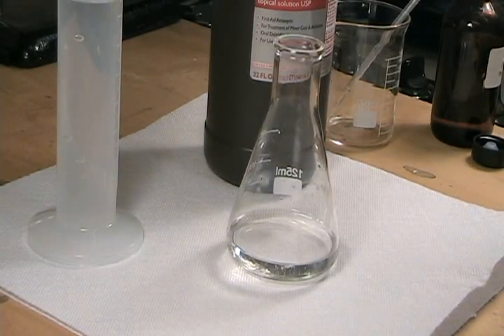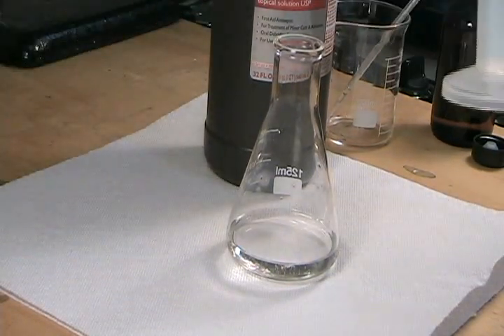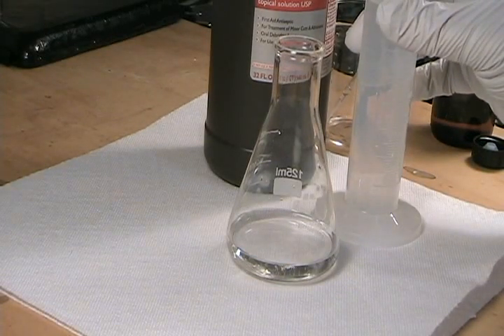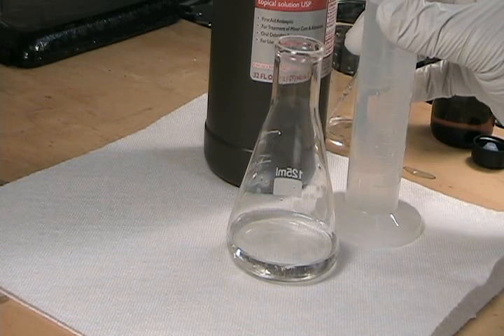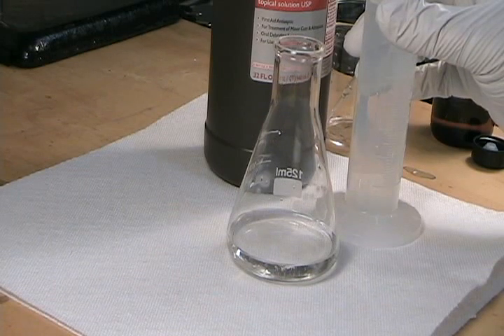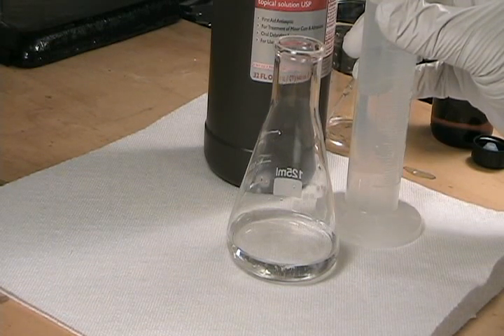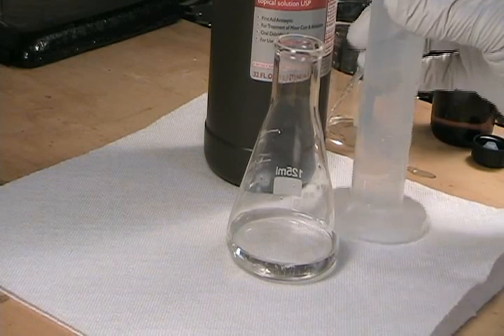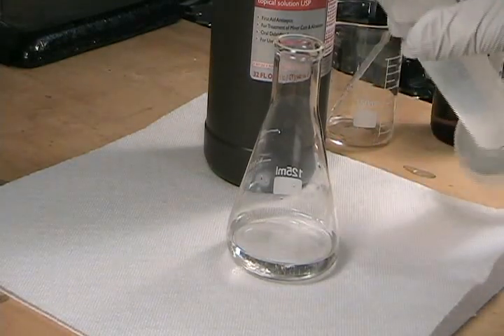The next step is to oxidize the bromide ions to elemental bromine. You can use almost any strong oxidizer to do that, including chlorine laundry bleach or potassium permanganate. I'm using ordinary drugstore 3% hydrogen peroxide because it's a very strong oxidizer that reacts to form only oxygen and water. I need at least 0.05 moles of hydrogen peroxide to oxidize all of the bromide ions to elemental bromine. Drugstore peroxide solution is about 0.8 molar, or about 0.0008 moles per milliliter, so I need about 62.5 milliliters. I'm actually using about 75 milliliters to make sure the peroxide is in excess.